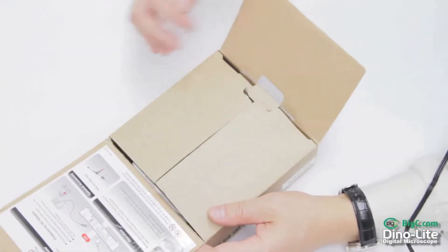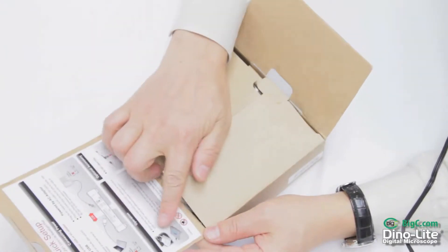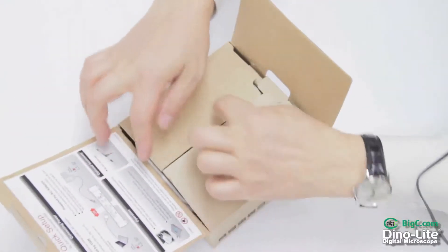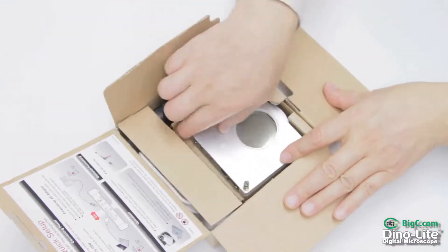The BLZ-W1 is our polarized backlight. This comes with a specimen holder that is attached by simply sliding it down onto the mounting stud on the top of the unit.